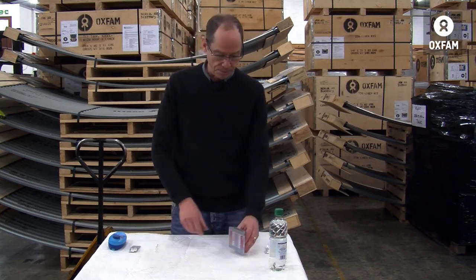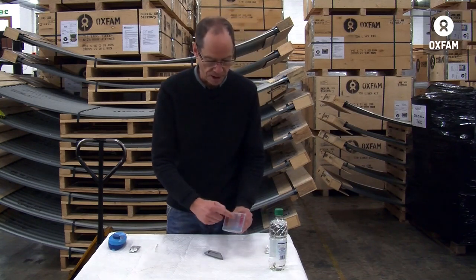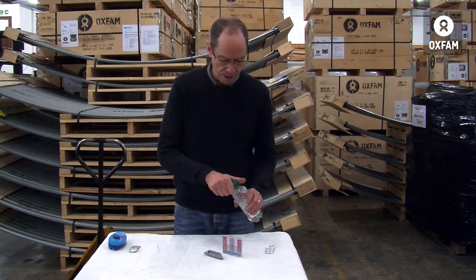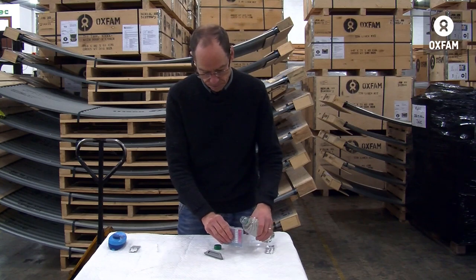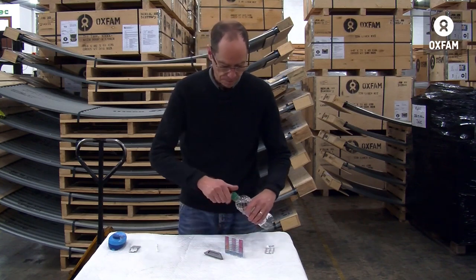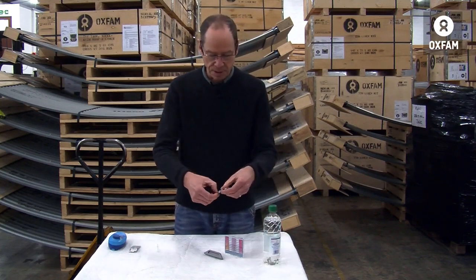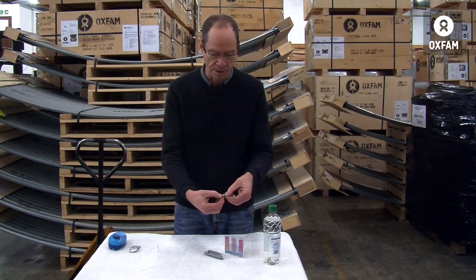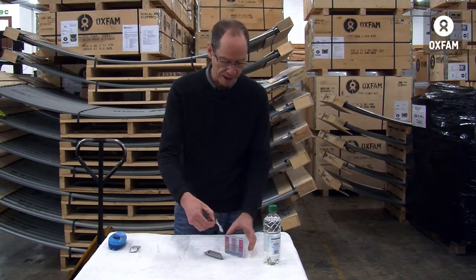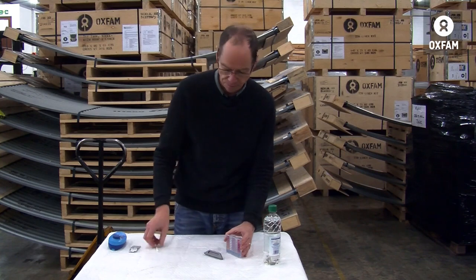So to use the Pooltester, you take your sample and add it to this vial on one side. You then take your DPD tablet and add it to the sample. You're careful not to touch the tablet with your fingers, so I break the foil with my fingernail, tear it back, and add my tablet.